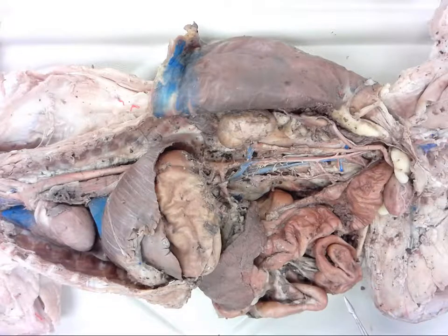Through the video, I'm actually going to be identifying quite a few structures that may not be on your list, but because I have such a good specimen here, we have some things that I normally don't see students identify, so I'm going to make sure I point them out. As you're studying and going through your list, make sure that you are picking out the ones that you do need to know.